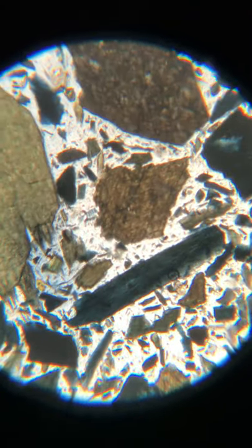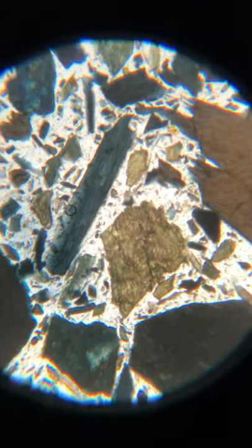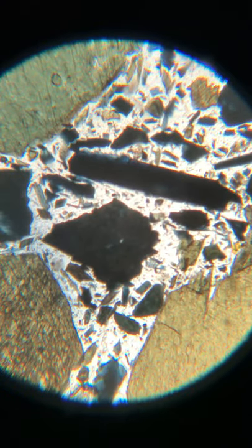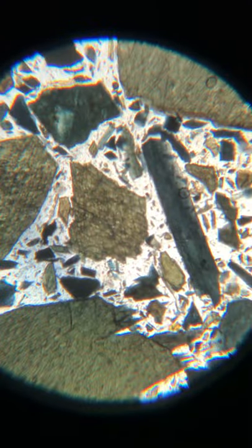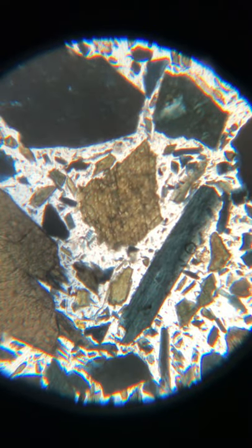I can see — and to note — it is an amphibole, and in this crystal in the center here, we can see two directions of cleavage. I hope you can see those. And they're obviously not close to 90 degrees at all. Not close to 90.